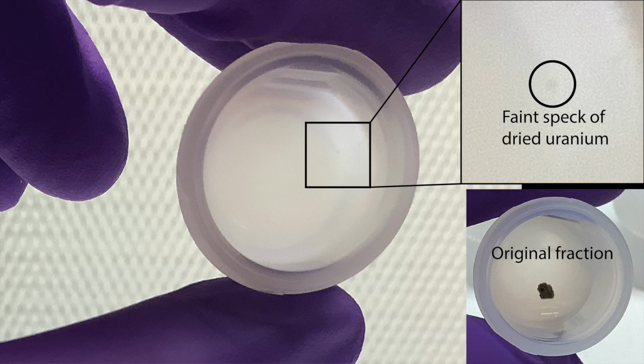Finally, we completely evaporate all of our purified separates in a drop of dilute phosphoric acid to prepare them for isotopic measurements by TIMS. You can see how much smaller these dried drops of pure uranium and thorium are, containing very, very little material compared to the original rock. In fact, most of what you can see in these specs is just the dried phosphoric acid.